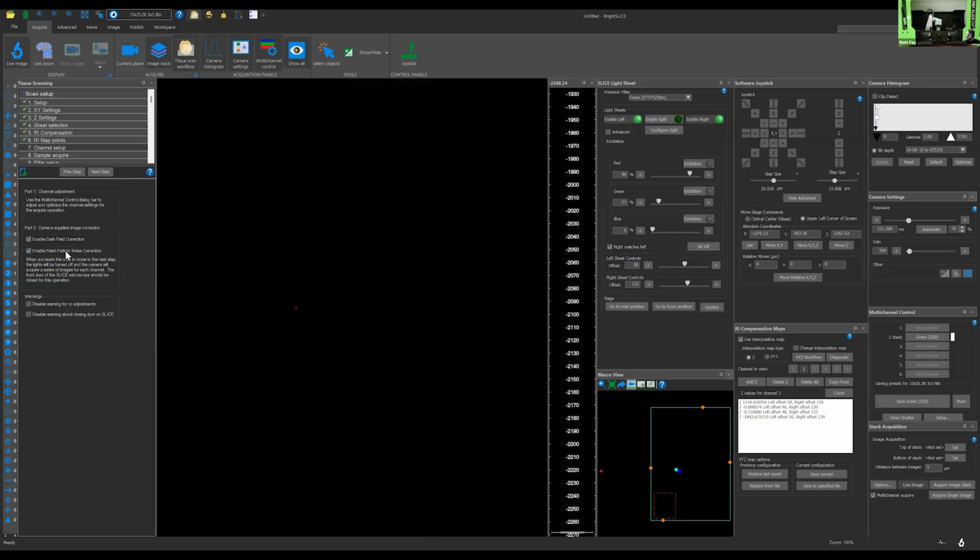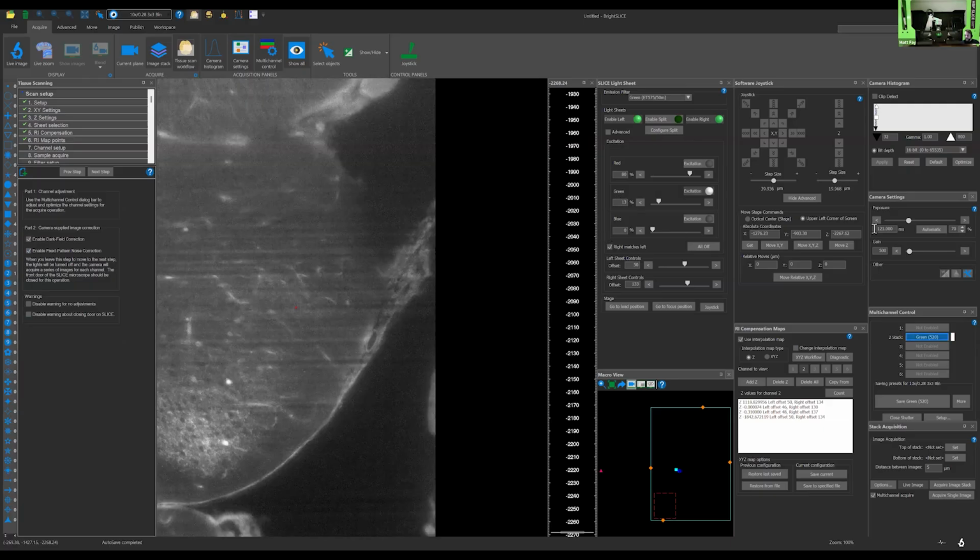And when I'm doing my setup, in case I get talking to you or someone else in the lab, I like to use low illumination intensity and a high exposure. That's going to prevent me staying in one area and maybe causing photo bleaching to our sample. So while I've been setting up there, I've actually been using a very low illumination power, 13% of our diode intensity, and an exposure of about 121 milliseconds.